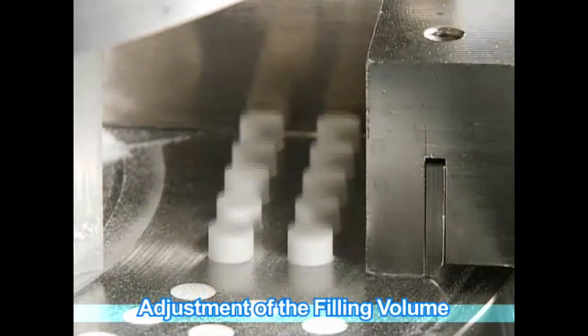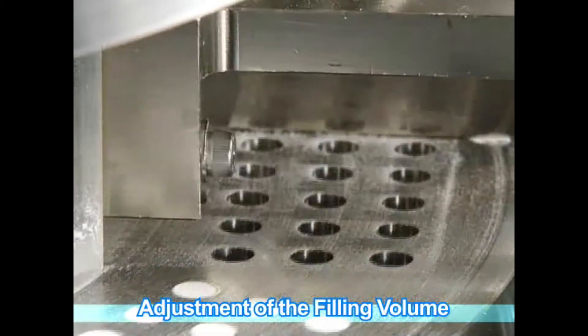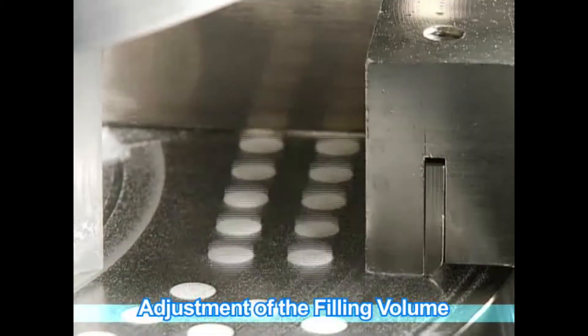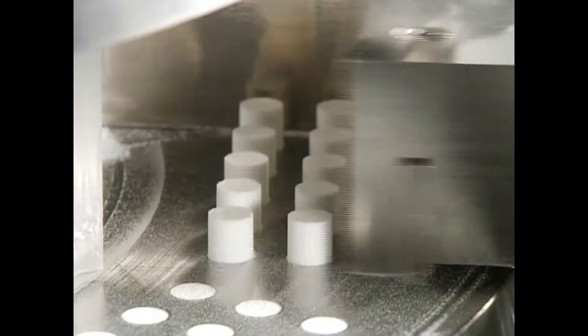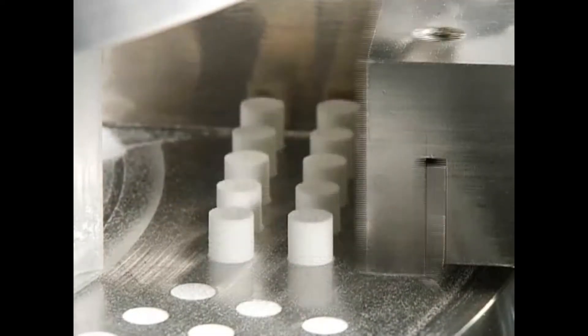The body is directly filled by the mechanical vibrator method and pressure is applied to maintain a constant density. The preset volume is raised from below, the excess powder wiped away, and after volume adjustment, the capsule halves are joined.